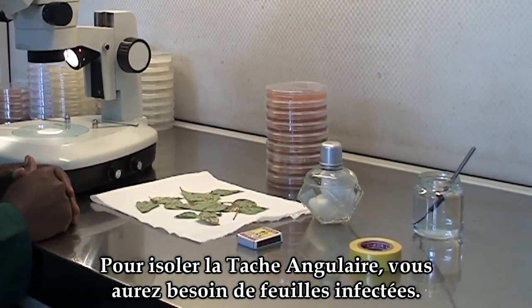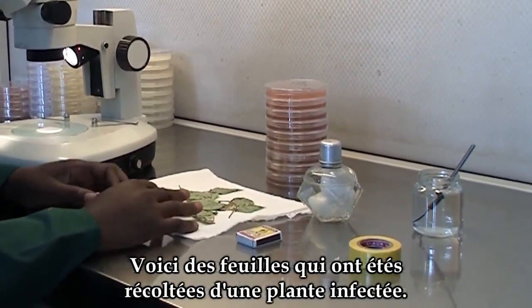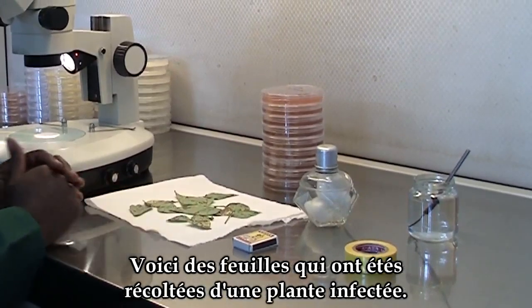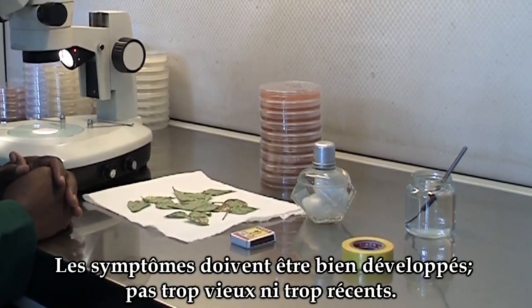To isolate angular leaf spot, you will need infected leaves. These are some leaves that have been collected from an infected plant. The symptoms shouldn't be old, but they also shouldn't be young.